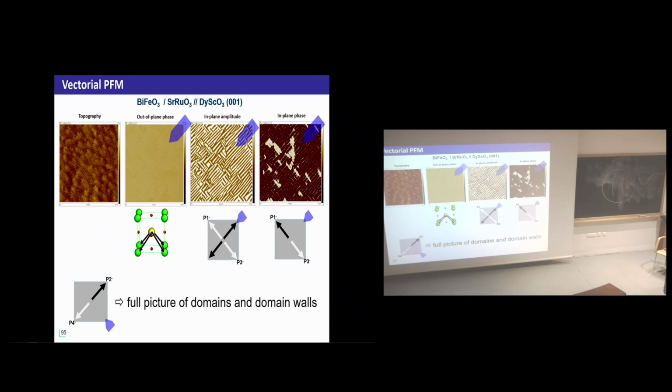Here? Because of the phase. Yeah, but could it also be the other way around? Like P1 is white? Yes, of course. You have to know your FM to know who is black and who is white. I mean, it comes from a lock-in. So I can just turn the button of the phase, and then black becomes white and white becomes black. So what is interesting is just the comparison. See what I mean? Okay.